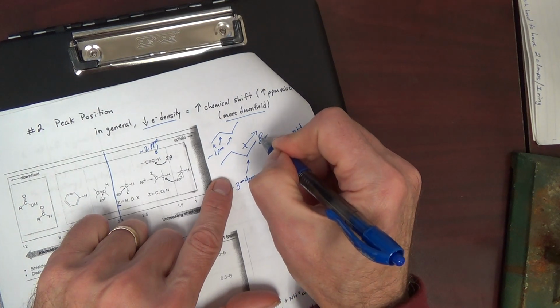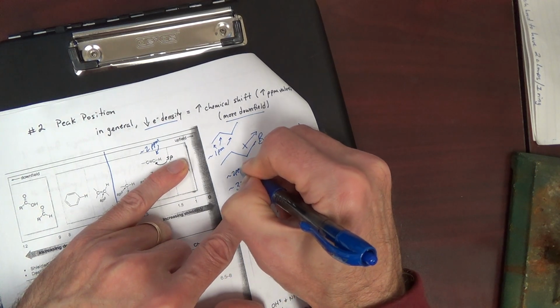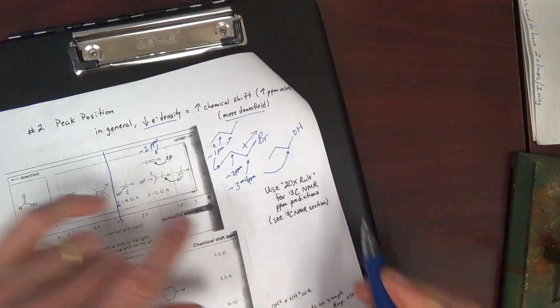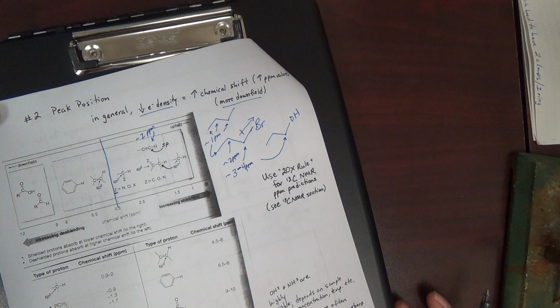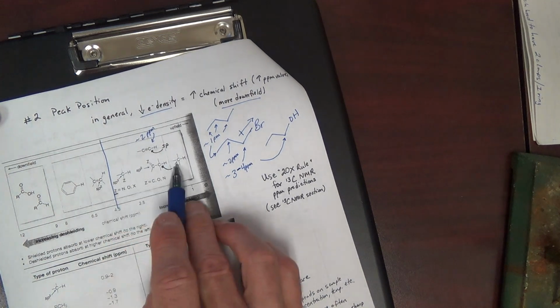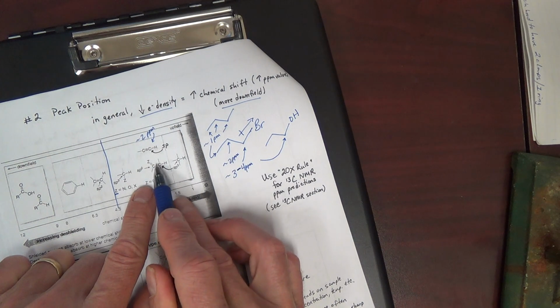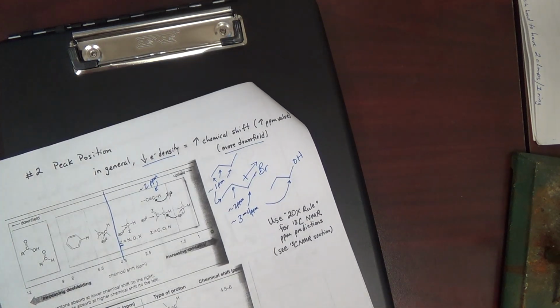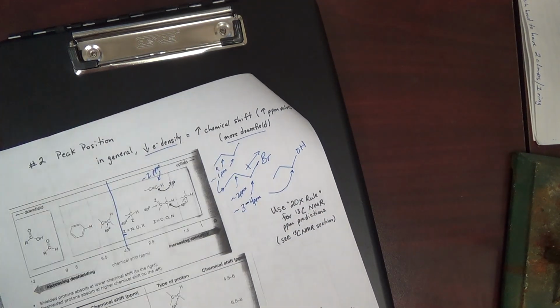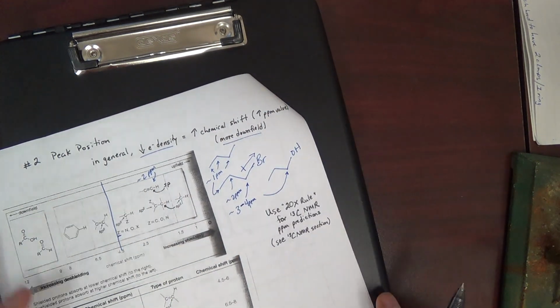But the electron withdrawing nature tails off, and this is going to be about 2 ppm. And then once you get further away, it's going to go back to the standard position of about 1 ppm. I'm going to write a good bit here. You may write in a different place so your handout doesn't come quite as jumbled as mine may be.